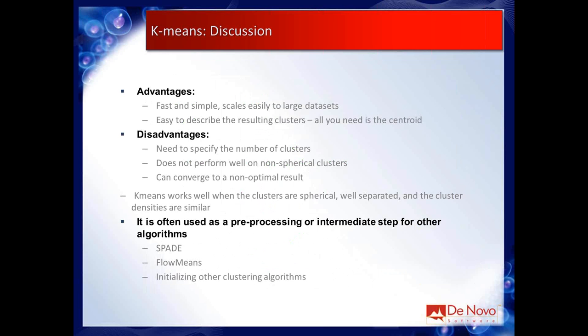Therefore the results can be different depending on how you initialize. Now there are a lot of existing heuristics that people use to deterministically say, okay, I want the centroids to be initialized in this way, but the results are going to depend on whichever method you use, whether it's random or some guess that you made based on your intuitive knowledge of the data.